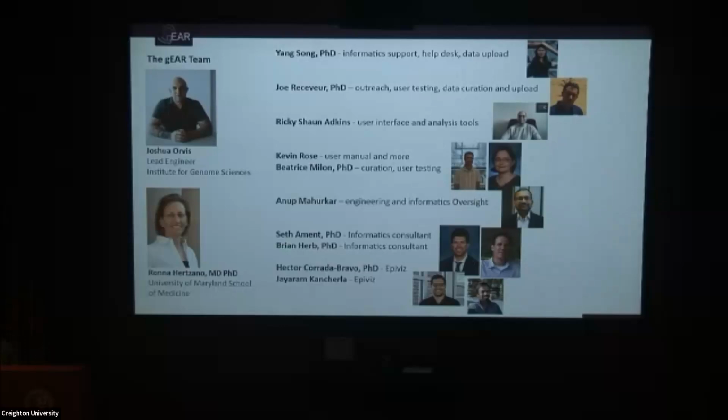Yeah, so you mean somebody else has uploaded the data and then you do your own analysis? I mean, it's public data at that point, like any other, so you should cite them for sure. But other than that, it's public data. And if you do an analysis yourself, like with the single cell workbench, you can also share that analysis. If you do a share link, when somebody goes to the page, it will preload automatically with all the graphics that you saw, and they can see what you've done and interact with it.